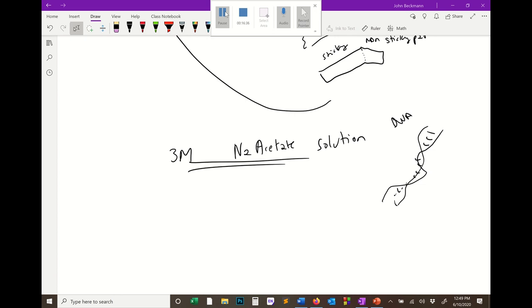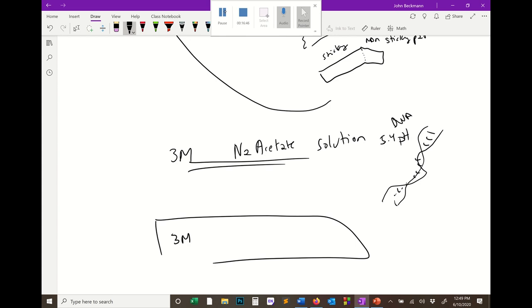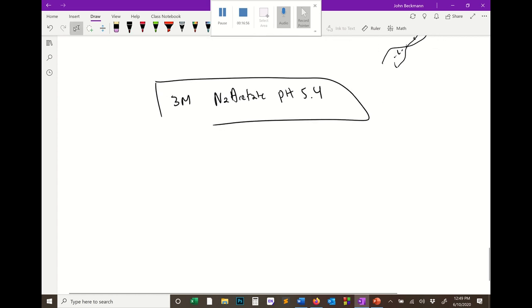And the sodium acetate that I work with to precipitate DNA is usually pH 5.4, okay? So what you would see on the label is 3 molar sodium acetate, pH 5.4. Okay, now how do you get it to pH 5.4?